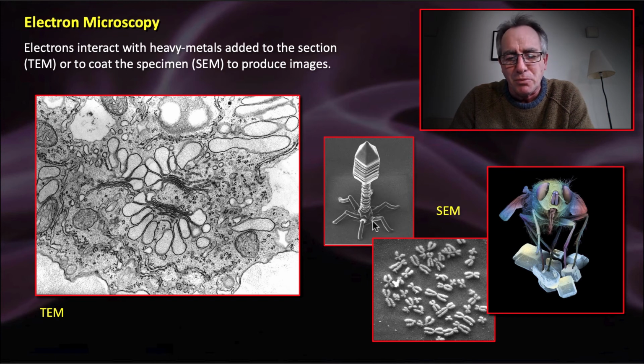Just a beautiful, beautiful scanning electron micrograph. Here we've burst open a cell that's at metaphase. You looked at metaphase chromosomes like this in one of the practicals in cell biology and genetics in first year. Here is that same sort of thing looked at with a scanning electron microscope. We can beautifully see the structure of the chromosomes, again, still at fairly low magnification.